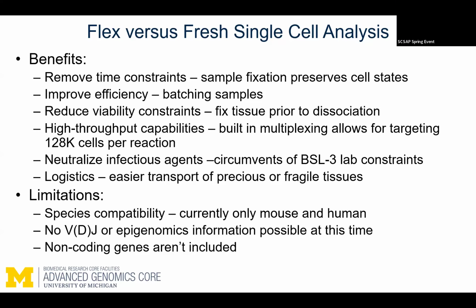So it's also really great if you have something infectious. There are probes that can be spiked in so that you can find that virus, or whatever you're looking for, later. And obviously that's one limitation. You can't go back to your data later and say, but I wanted to find my virus, and you can't find it now. I can't go back and find your GFP for you. That has to be spiked in on the front end. But as long as you've done that pre-planning, it's a really great system.